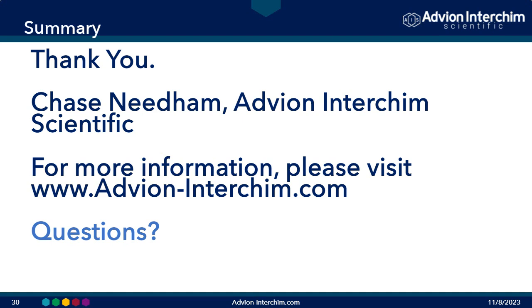Great, thank you, Chase. This next question asks, what is the advantage of smaller particle size silica? Okay, so I mentioned that we have 15 micron silica. The standard silica for most purifications is a 50 micron particle size. So the smaller the particle size, the higher the efficiency of the purification media is. What that means is basically it allows you to separate your compounds in space more efficiently.